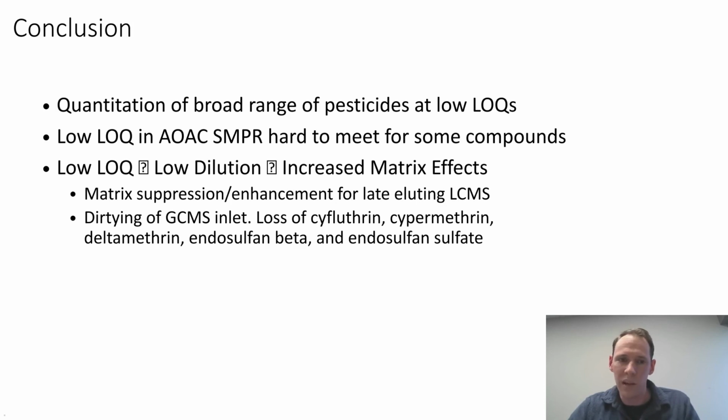And basically, my focus in the method development, keeping these limits of quantitation in mind, was to try to increase the sensitivity of the method as much as possible. And the way that I approached that here was to not dilute the sample too much, which would effectively increase the amount of analyte that is being seen by the detector. And I think that that has definitely contributed towards some of the issues I saw with the matrix effects, differences between the different strains.